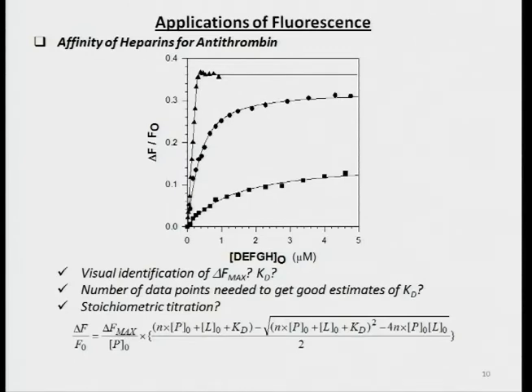Now under certain conditions, you might actually have this complex already preformed, and then you introduce something like heparin. So if you already have a preformed complex and you introduce heparin, let's say it binds to the protein on the other side, then it may be that this comes back out.